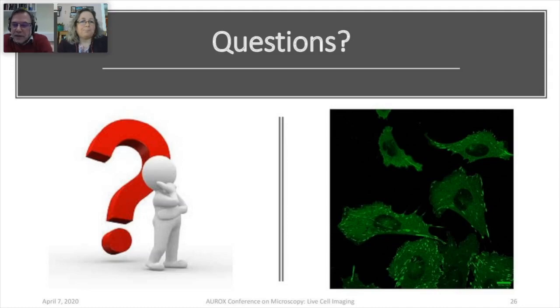Yeah, so that gets me to the next question, which is the basic confocal. There are many different ways to do confocal or sectioned microscopy these days. There are wide field techniques, and quasi-wide field techniques where light is clearly much more uniformly distributed in space and time, as opposed to point scanning confocal or even nonlinear point scanning confocal like two-photon, multi-photon. And super resolution techniques, STED is also guilty of high concentrations of light. So how would you comment on that? And is there a benefit in your view to move towards more wide field techniques or more distributed techniques?